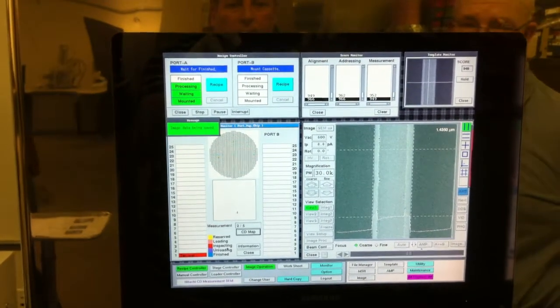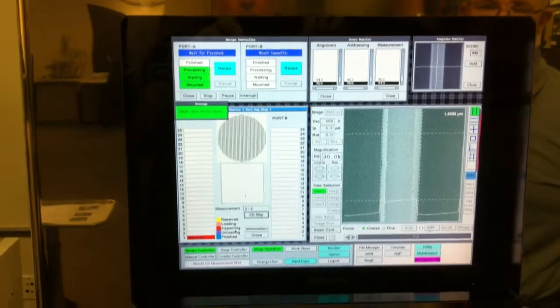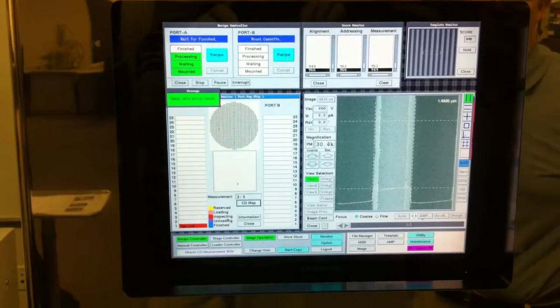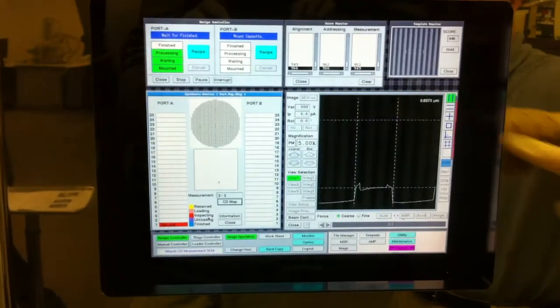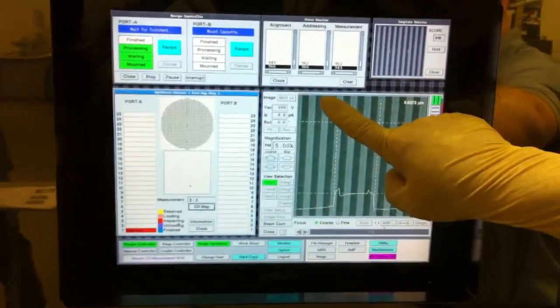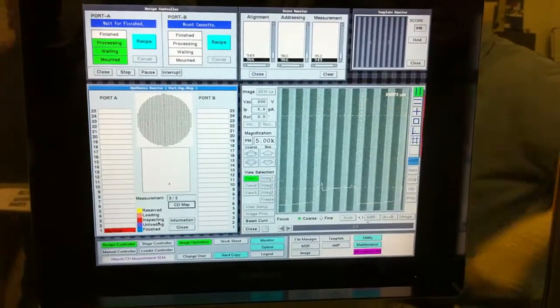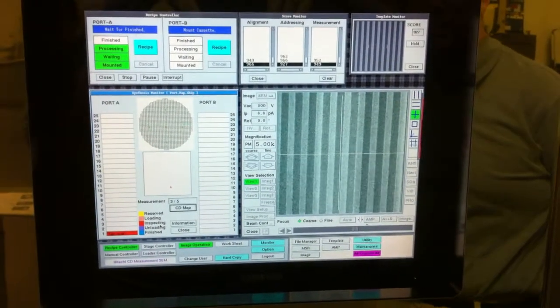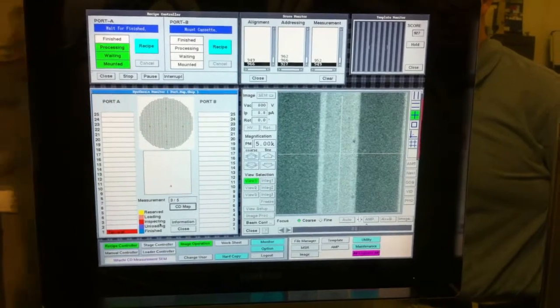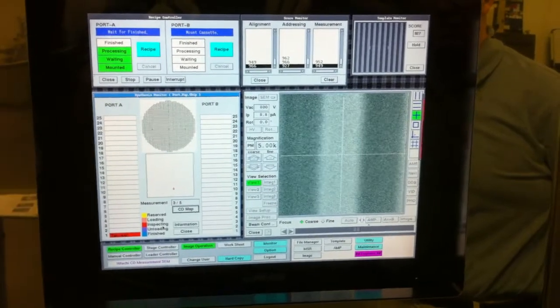We can see up here the scores on the pattern recognition in the 900 range. The image is looking very good.